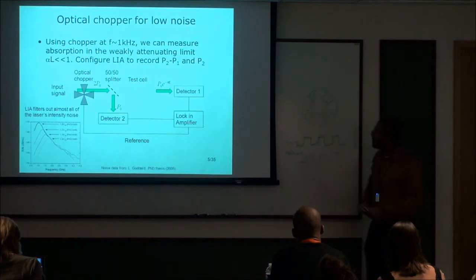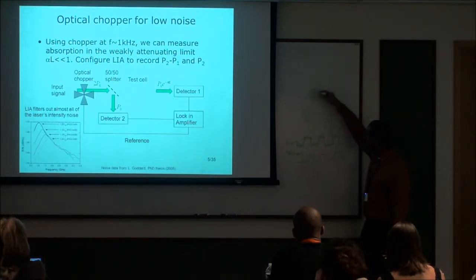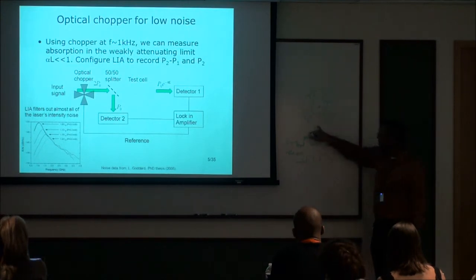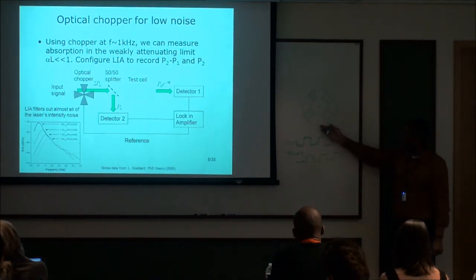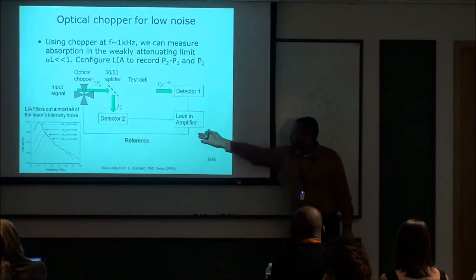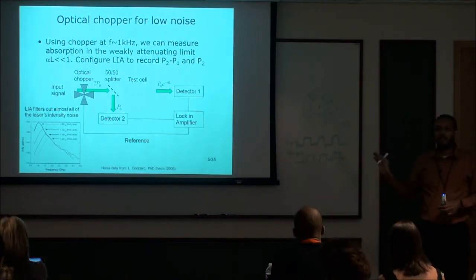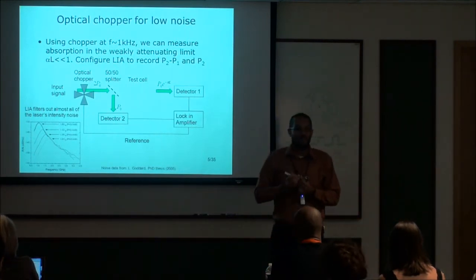The way that the optical chopper does this is that internal to this motor, there's a motor that's spinning this around, and the laser beam passes through one part. As this spins, it generates an internal reference signal that it converts to an electrical signal because there's a photodetector here, and this photodetected signal goes to your lock-in amplifier, and that's the reference. Does that part make sense? Please ask questions as we go along. I want this to be interactive.